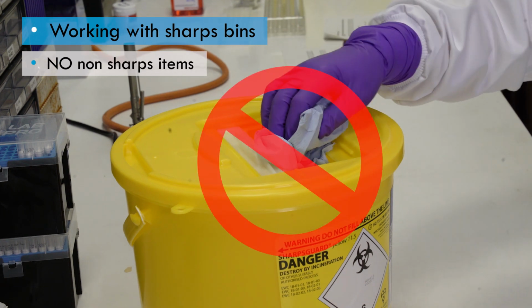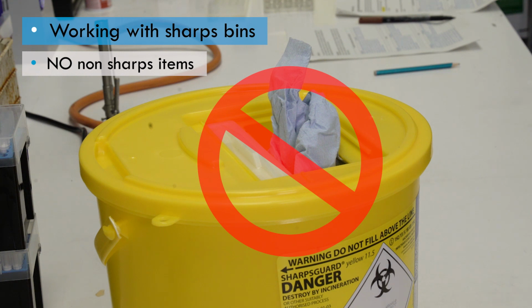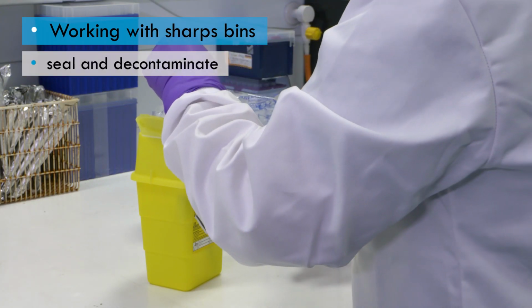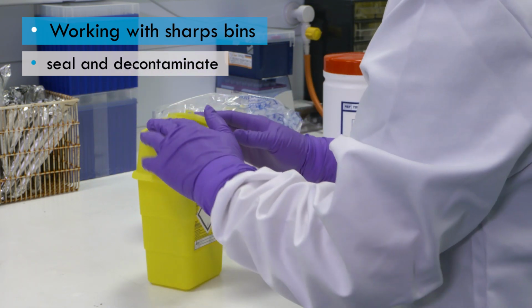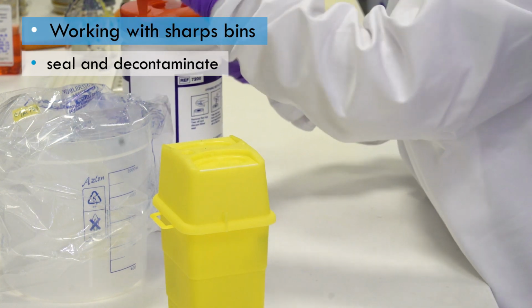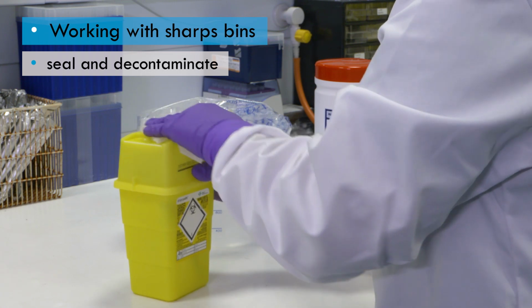Non-sharp items, such as absorbent tissue, loops and spreaders, should not be placed into the sharps bins. Once the sharps bin has been filled to its maximum fill line, the lid should be sealed shut. The box should then be wiped with an appropriate disinfectant product before storage and disposal.